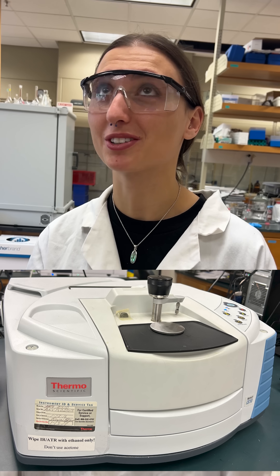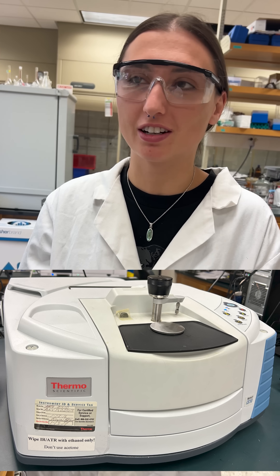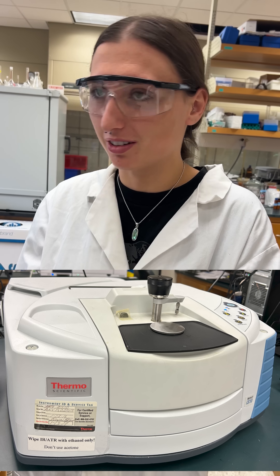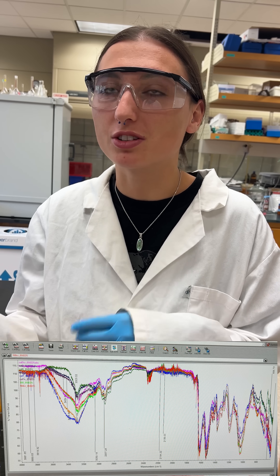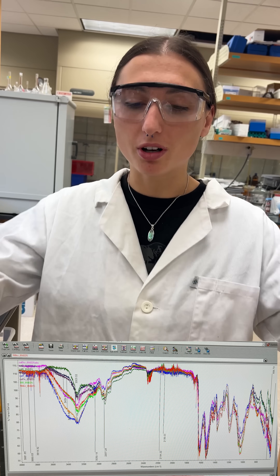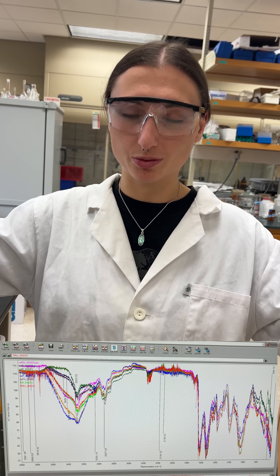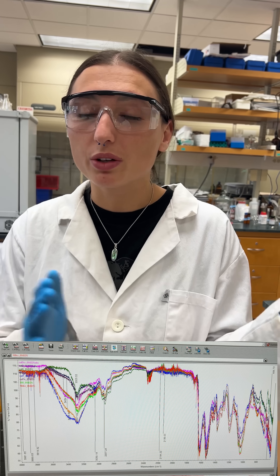So what's IR? Infrared spectroscopy. We're going to be measuring the functional groups on our samples and the bacteria to know how they change when they're in the presence or absence of chromium. Then we can compare — we'll put all the different spectra on one plot and compare them to see what changes in what region.